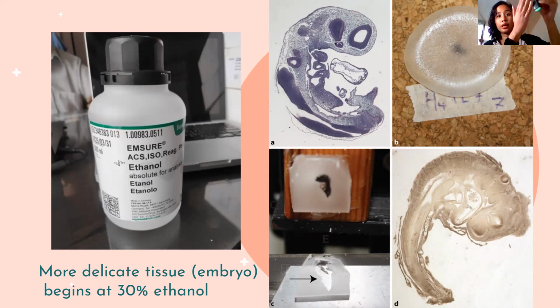So, ganito yung paglapat ng embryo, class. Hindi ganon, not lengthwise, not standing up. Because once you put your mold, pag-gilid, naka-side view yung embryo, mali, di ba? I hope that you're getting it, that it's very important that we orient the embryo ng maayos.